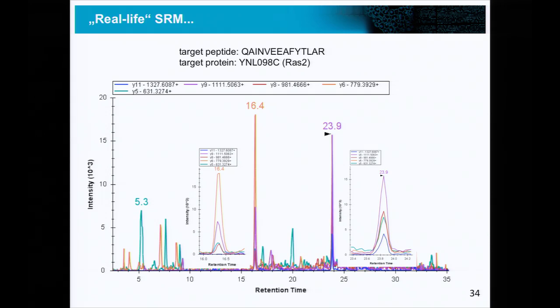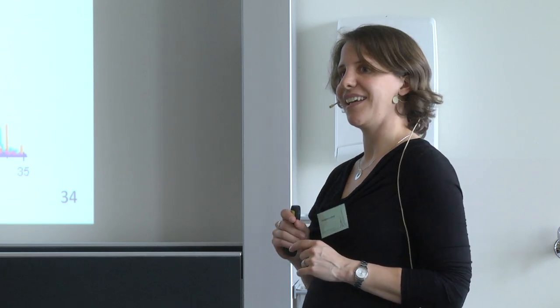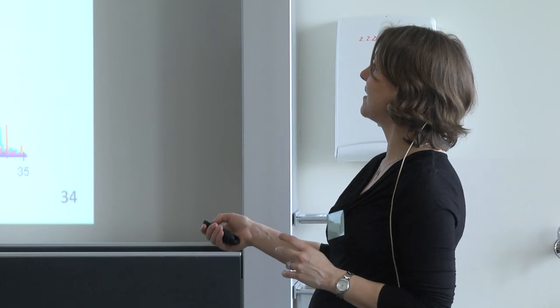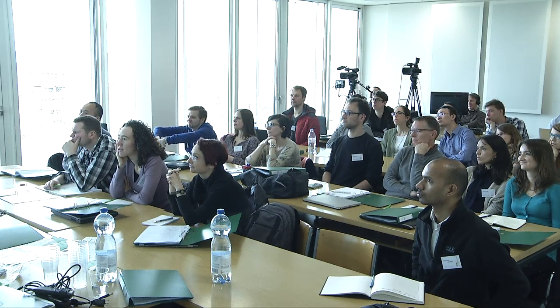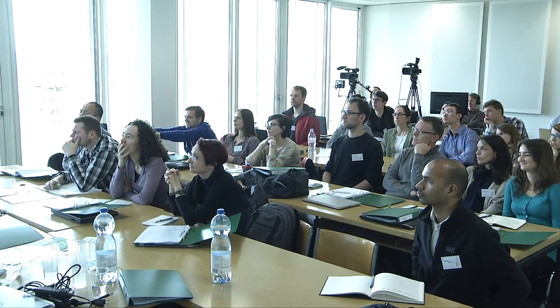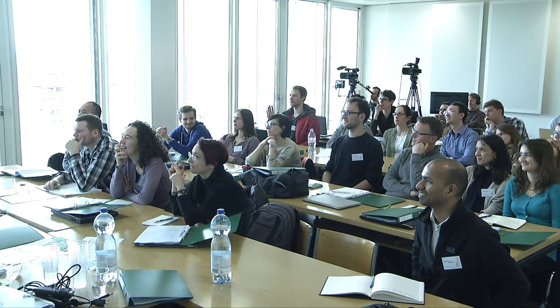What do you think is the right peak, at 16 or at 23 minutes? Which one shall I choose? Maybe we can make a guess. So who thinks 16 minutes is the correct peak? Raise your hands. Nobody. And who thinks 23 is the correct peak? You're not allowed to not raise your hand.